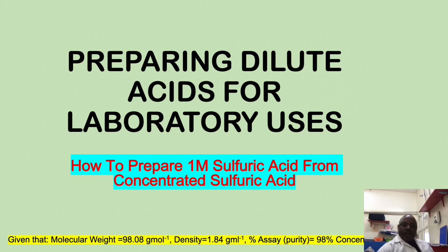Today, I will give you a brief demo on the preparation of dilute acids for laboratory uses. Specifically today, we want to prepare 1 molar sulfuric acid from concentrated sulfuric acid. How to prepare 1 molar sulfuric acid from concentrated sulfuric acid.